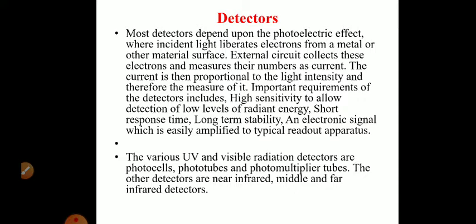Now, what kind of a detector do you require? The important requirements of a detector are, first, high sensitivity. The detector used should be highly sensitive to allow detection of even low levels of radiant energy.